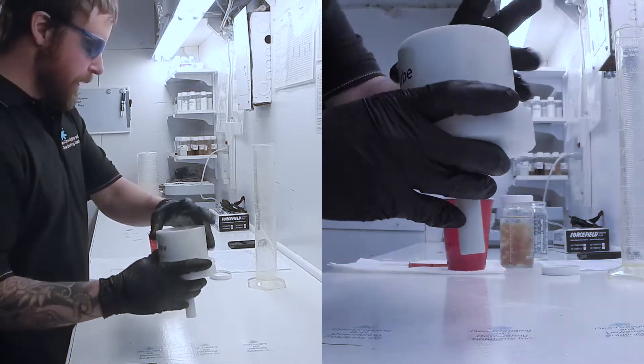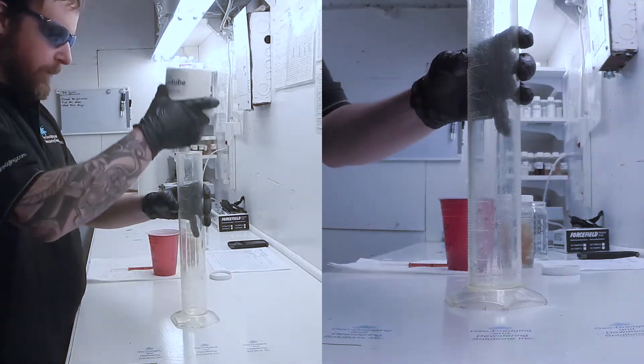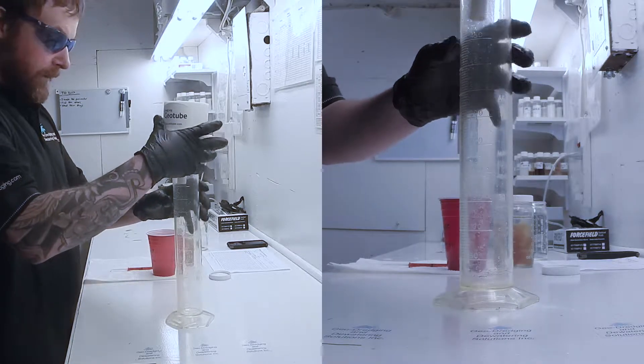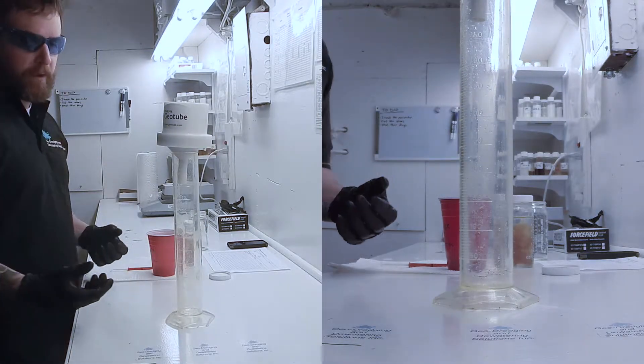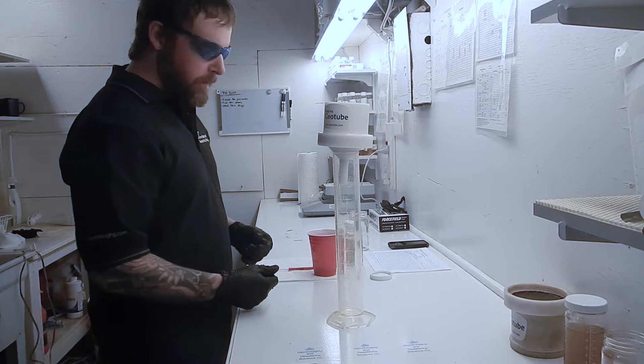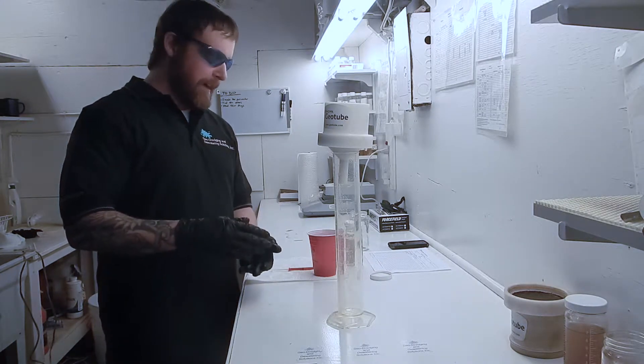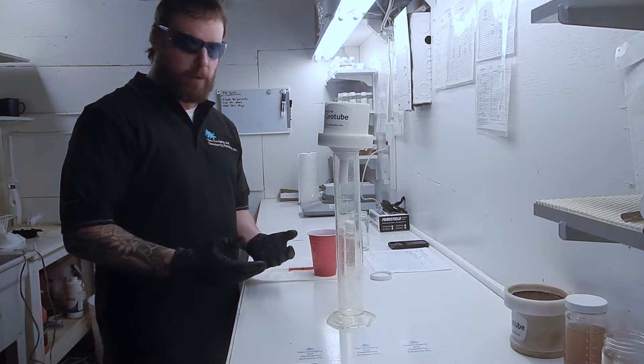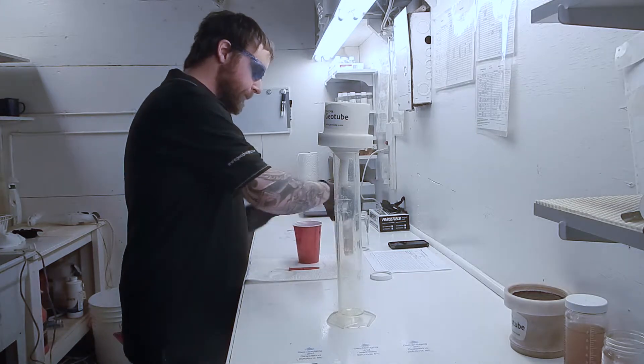We then place the RDT on top of a graduated cylinder and using some type of timepiece, in this case a cell phone, we'll time out a minute and see how much effluent is collected from the dewatering test. Here we go.